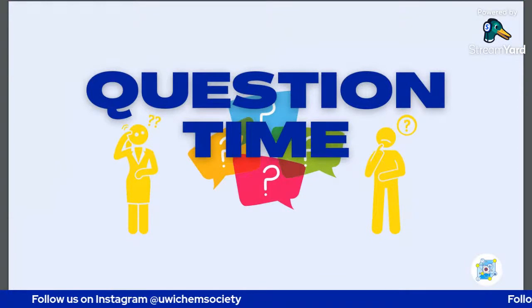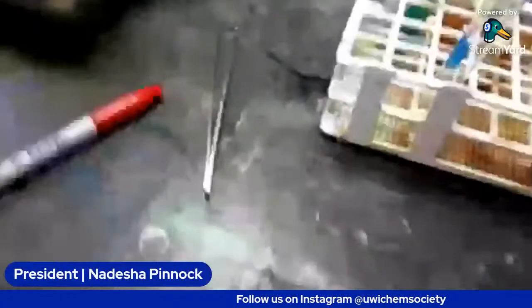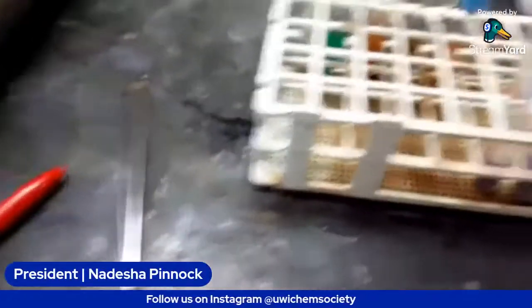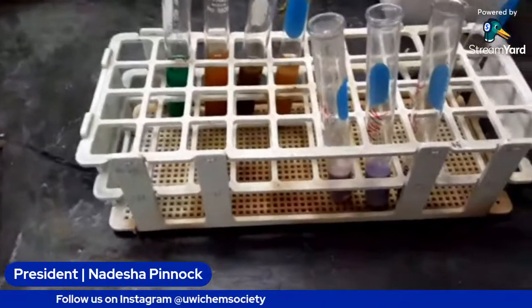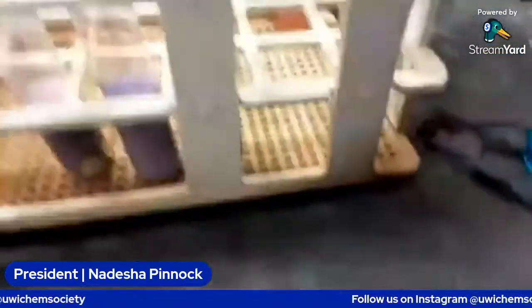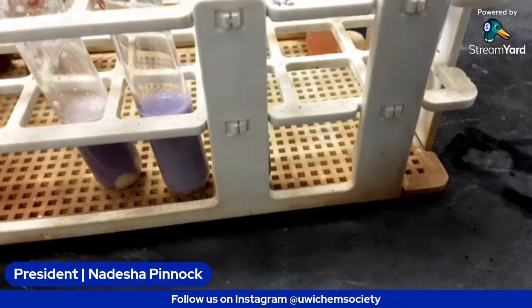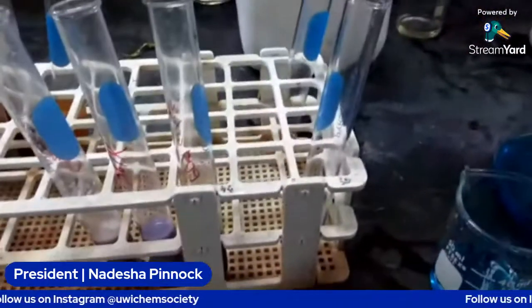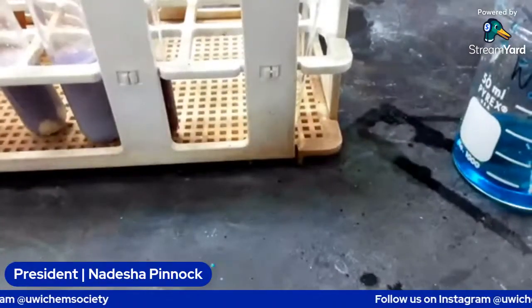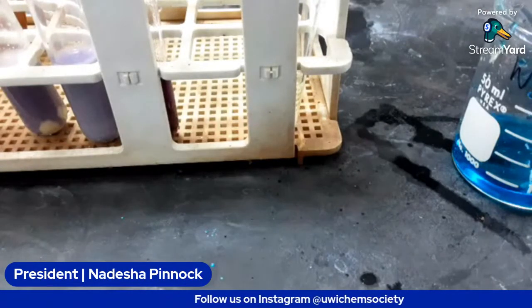All right. So let's go back to the experiment. So we're going to use oil. So this is our oil. We're going to add ethanol to it, about 3 mils. So the dropper is approximately 1 mil. So we're going to add 3 droppers.